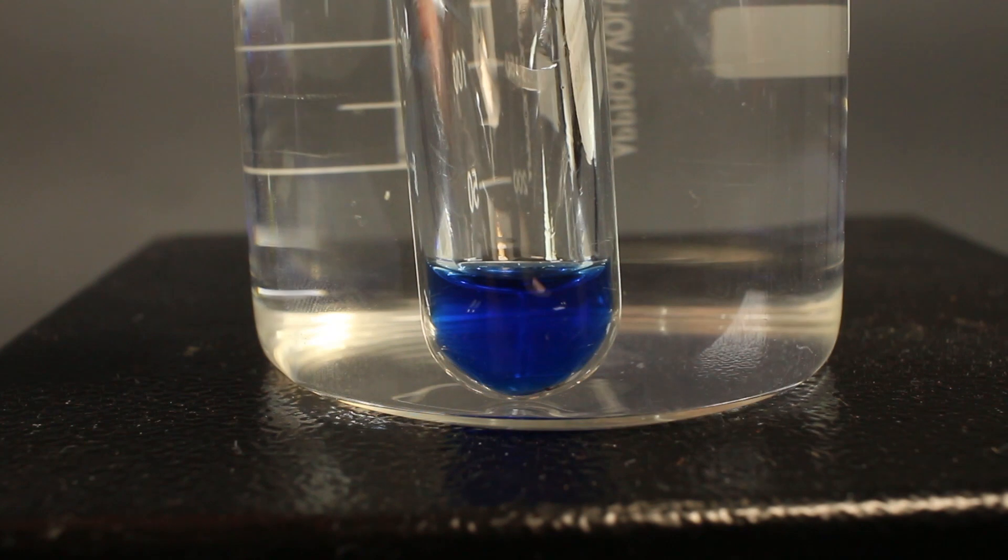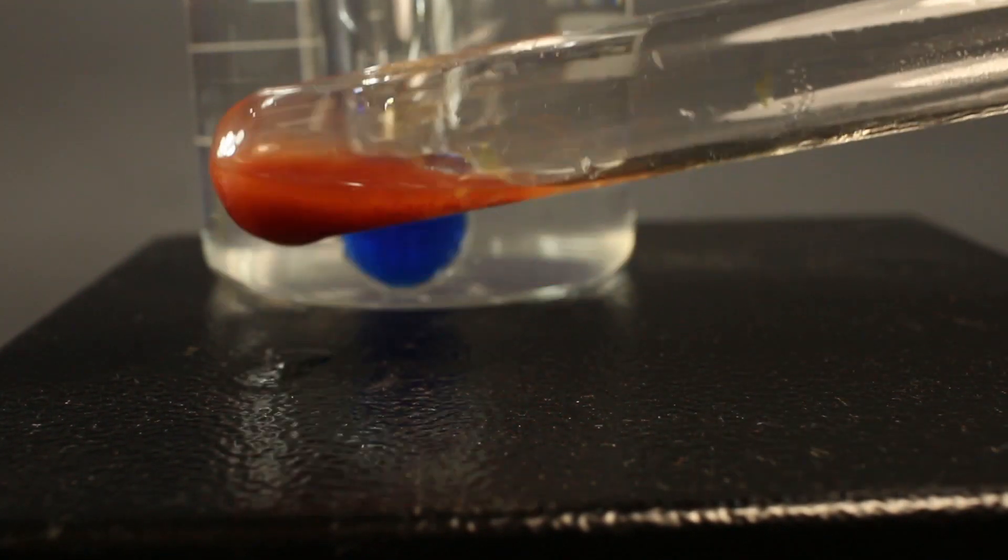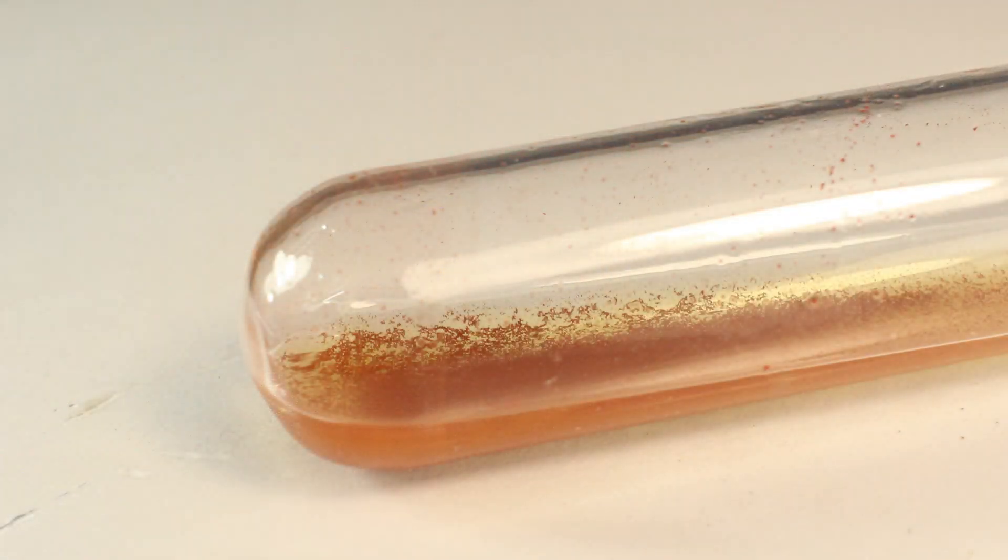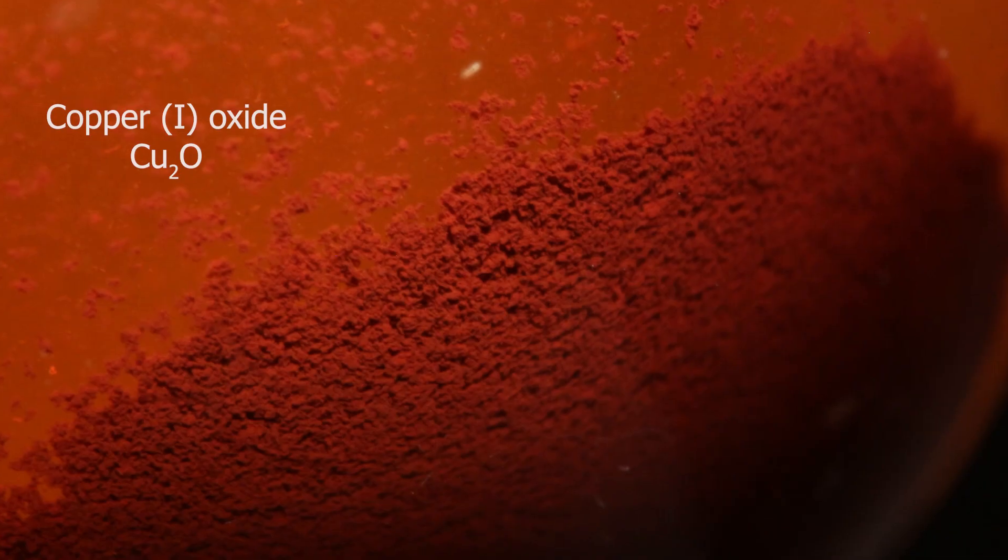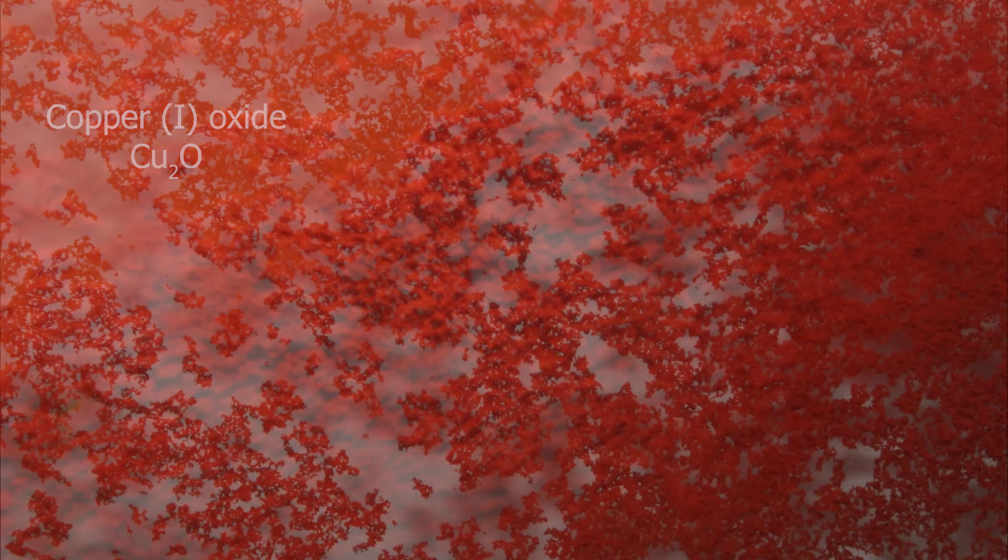So, here is the end result. Positive result for glucose. It can look brown just like that, depends on lighting, in fact, but here I'm proud of my red color of copper 1 oxide.